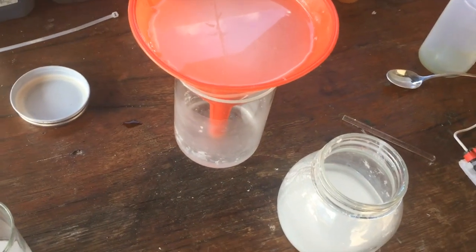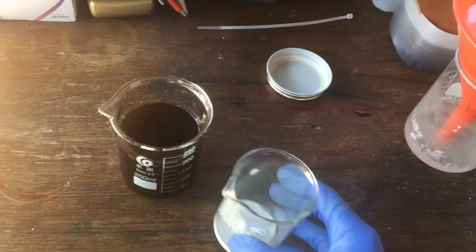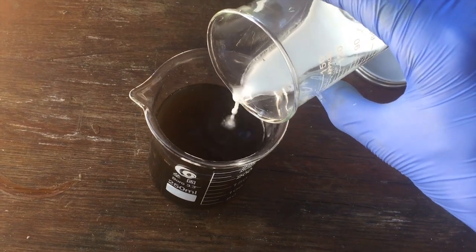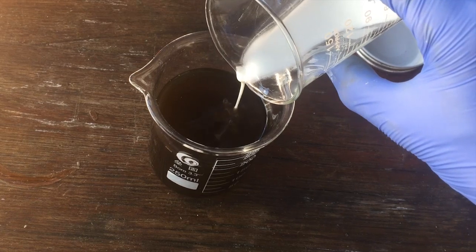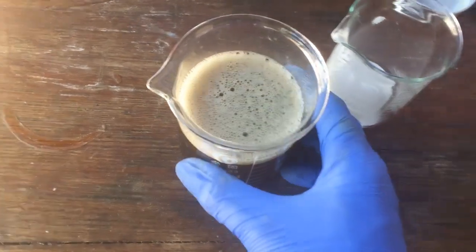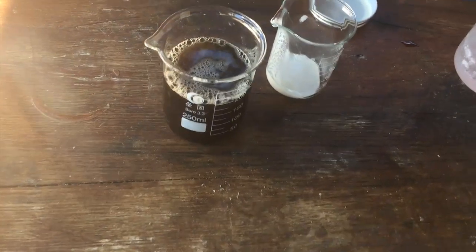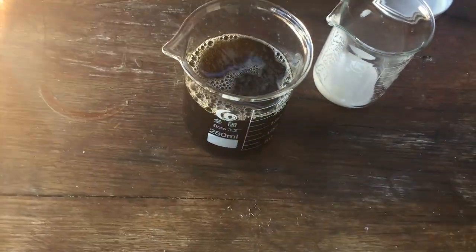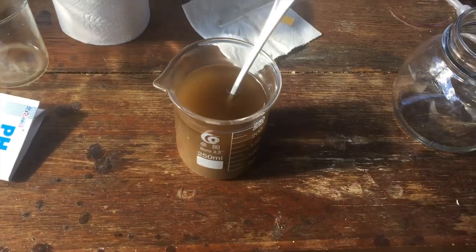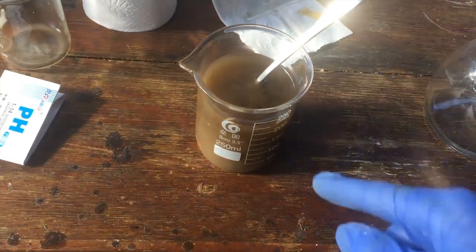We've got quite a bit of calcium carbonate. Adding it to our acid from the last step should react and give a bunch of precipitates that we can filter out, removing everything that's not nitrates. Calcium nitrate should be soluble, but any other calcium salt we can make should precipitate out. Finally we've added enough calcium carbonate and neutralised all of the acid in here.